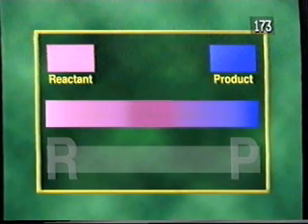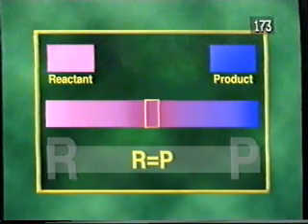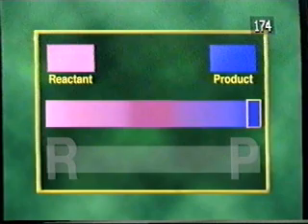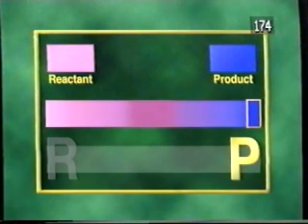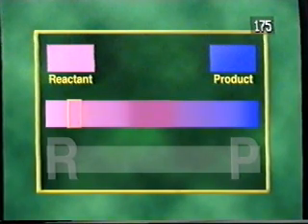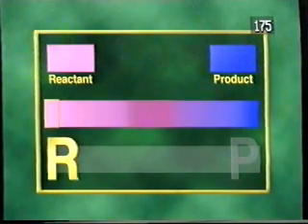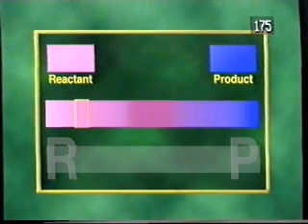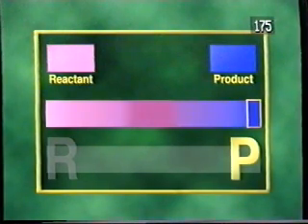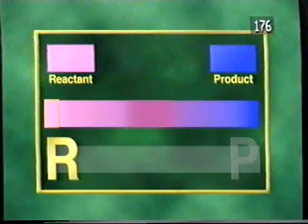We started off with a violet solution containing equal amounts of the reactant and product. When the violet solution was placed in boiling water and heated, it became blue, as all the reactant was converted into product. On cooling, the violet solution went pink, as the product was converted back to reactant. When we swapped the solutions over, the pink solution warmed up and slowly became blue. Whereas on cooling the blue solution, it changed back to pink.